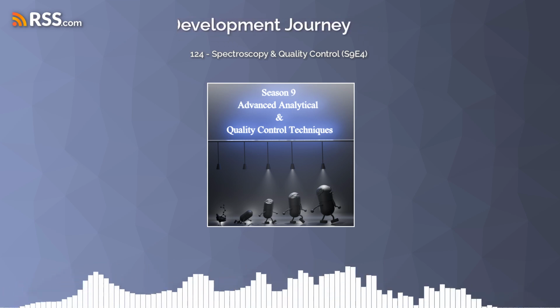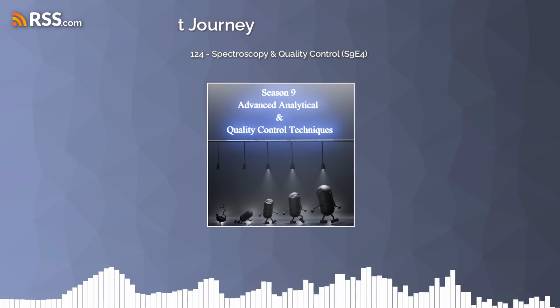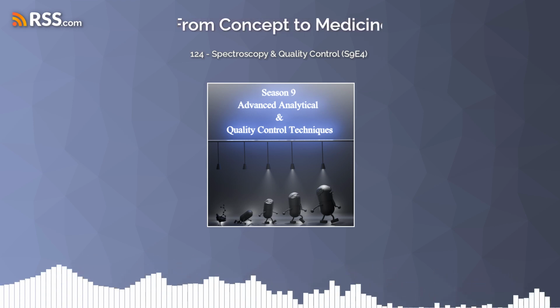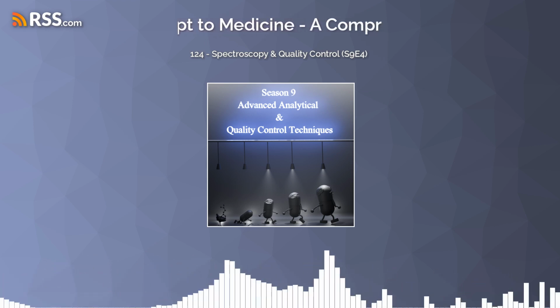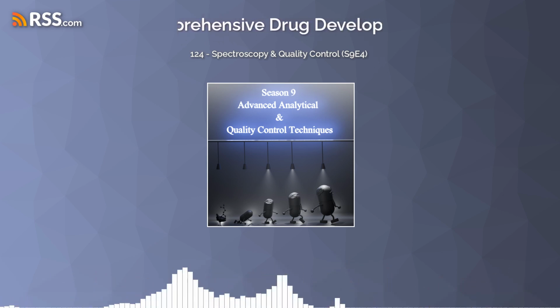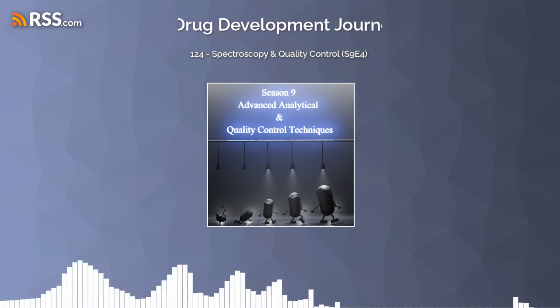So think of it like IR spectroscopy is giving each molecule a unique vibrational signature. And that allows us to really pinpoint what functional groups are there. So you're looking at what wavelengths of light are absorbed. Exactly. And from that, you can infer the functional groups that are present.